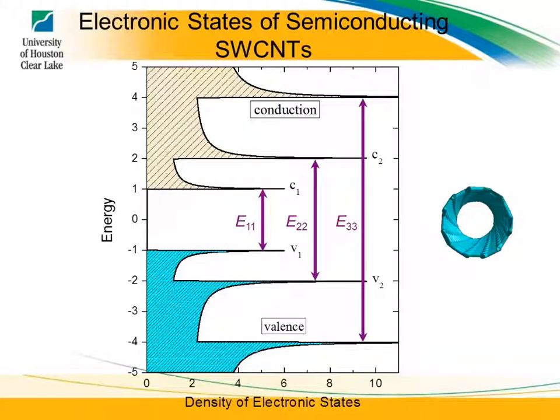They only fluoresce when they're excited, right? Right. You need an excitation laser in order to see the fluorescence. Otherwise, all of your electrons are going to be sitting in the valence band. But if you hit it with the right wavelength, we were using a 650 nanometer laser, which is about the same wavelength as a laser pointer, a little bit higher in energy, about 20 milliwatts.